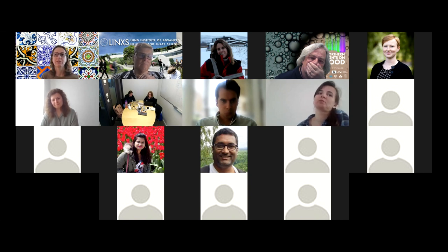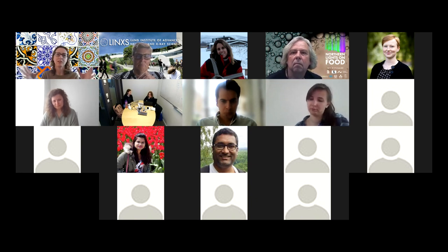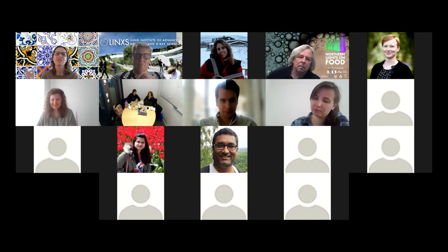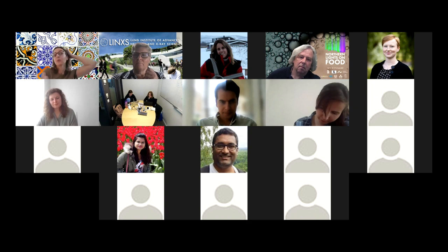Again, you do your best to try to come up with an equation, and you read the literature and you try to come up with a model. Reach out to someone who has done models, reach out to one of us. If you come to a SASView code camp, and you don't have your equation, they probably will not be able to help you. Unless you talk to someone like Paul, you know, unless you talk to one of them who also does models, like Paul Butler, for example. Talk to one of us, basically. And they'll try to help you with the equation.